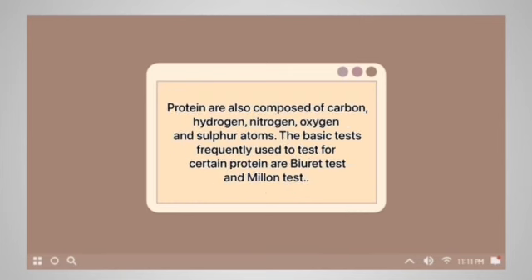Proteins are also composed of carbon, hydrogen, nitrogen, oxygen, and sulfur atoms. The basic tests frequently used to test for certain proteins are the Biuret test and the Millon test.